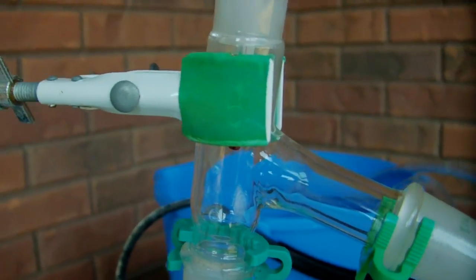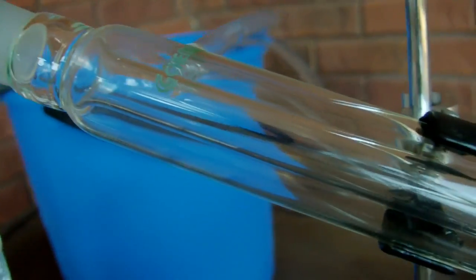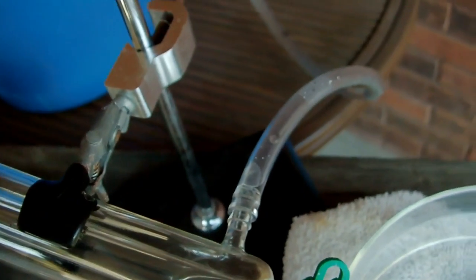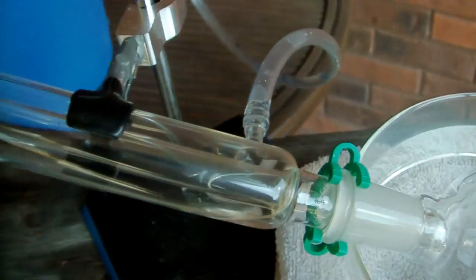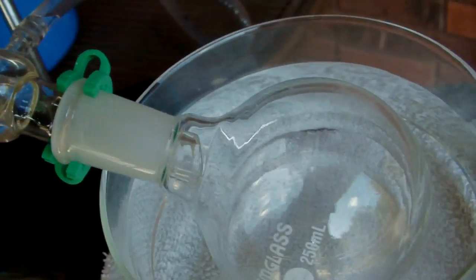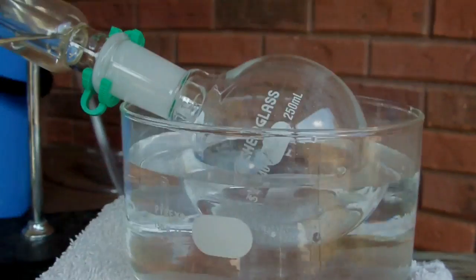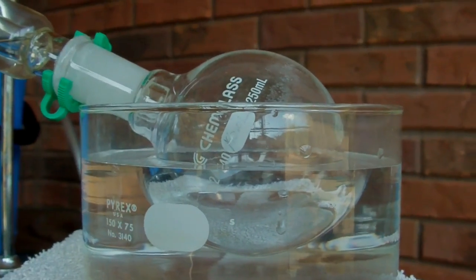That still head is then connected via another Keck clip to my condenser, which is a water-jacketed Liebig condenser. There's an inner tube where the gases and condensing acetone will flow down, and an outer tube around it where water flows in through hoses connected to a bucket of water. I'm going to be pumping water in through the bottom, which will fill up and drain out the top. This provides a long, cool environment for the gases to condense. That is then connected via another Keck clip to a collection flask sitting in a water bath where I'll add ice to keep any condensed acetone as a liquid.